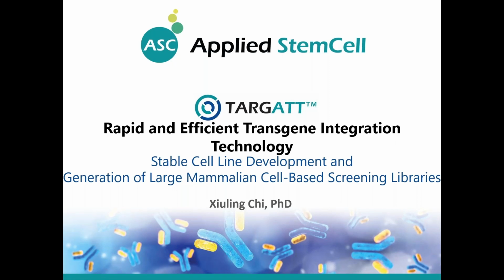This webinar is on TARGATT, which is rapid and efficient transgene integration technology, particularly on stable cell line development and generation of large mammalian cell-based screening libraries.